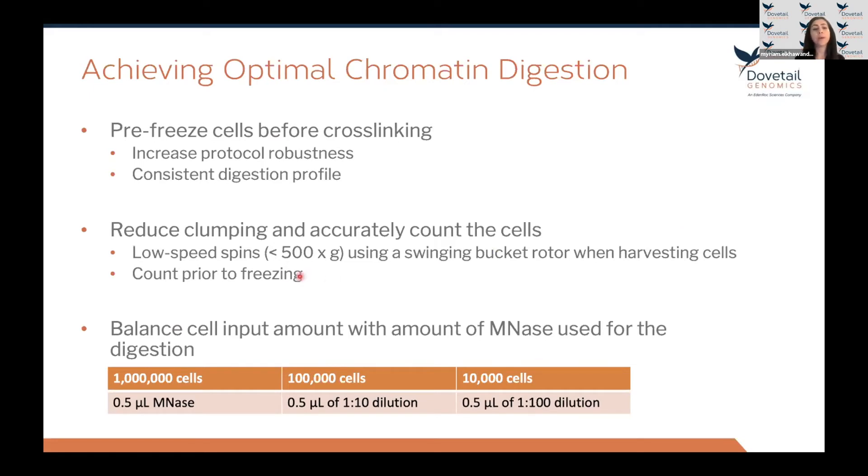The number of cells you start the assay with will influence the amount of MNase used. To help with more accurate counting and to reduce cell clumping, we recommend harvesting cells at low-speed spins using a swinging bucket rotor. Count the cells before freezing: harvest, wash with PBS, count, spin down to remove supernatant, then freeze the pellet at -80°C for at least 30 minutes before cross-linking. The standard protocol calls for 1 million cells, but we provide digestion guidelines for lower input down to 10,000 cells.